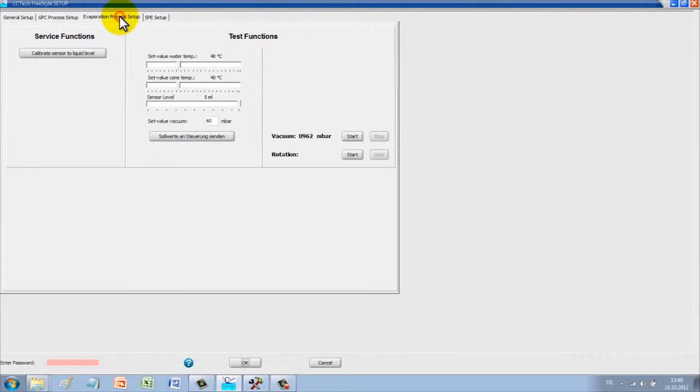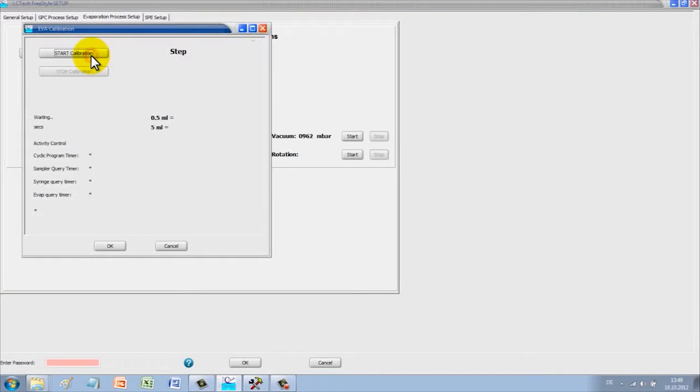In order to ensure that the end volume is always precise, the chamber is calibrated at the push of a button. It couldn't be more precise.